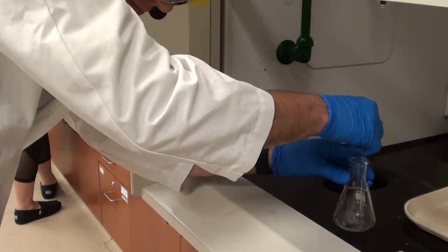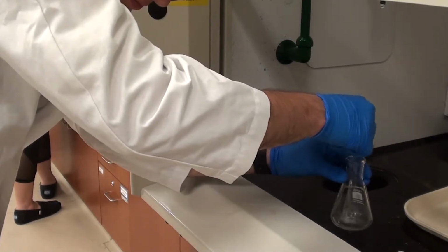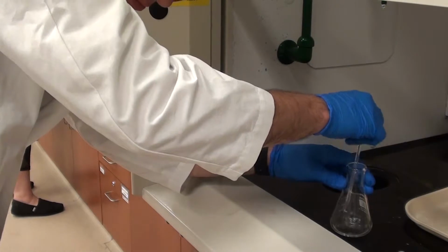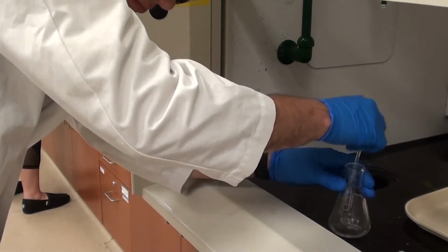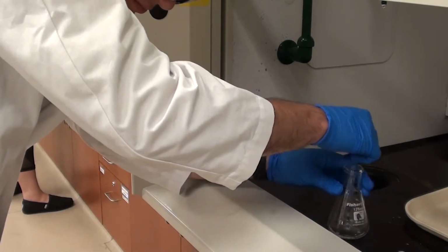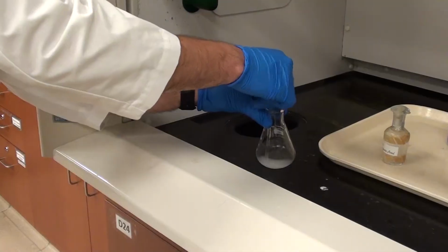And what's going to happen is eventually this will all turn kind of slushy. Why don't you go ahead and see if you can push some of that solid into the solution there, Matt. There we go. Alright, so keep on stirring.